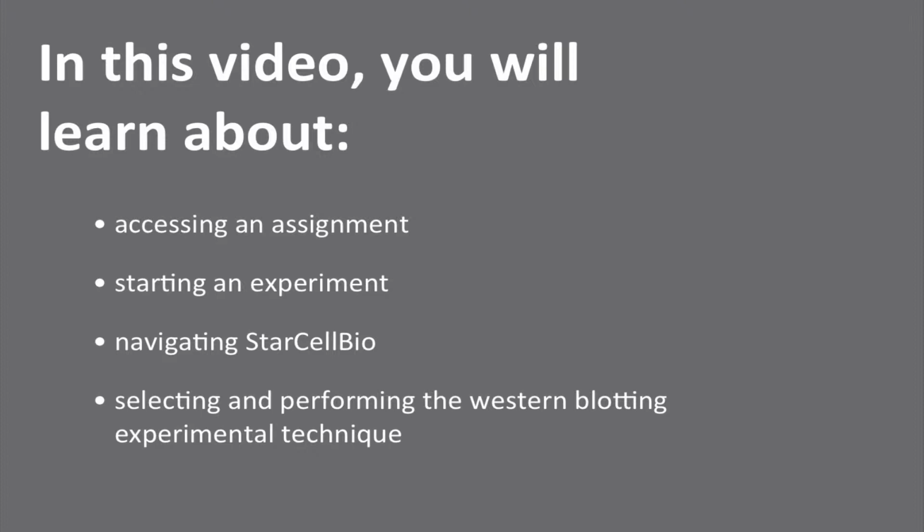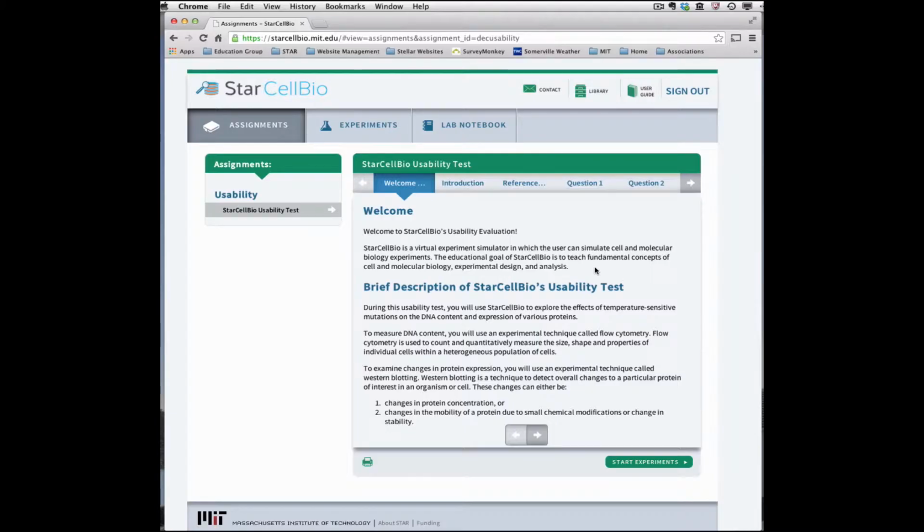This video will highlight these features of StarCellBio using the Western blotting experimental technique as an example. Many of these features are the same in the other experimental techniques within StarCellBio. We will highlight the flow cytometry and microscopy experimental techniques in video tutorials 3 and 4 respectively. Now let's take a tour of the StarCellBio user interface.